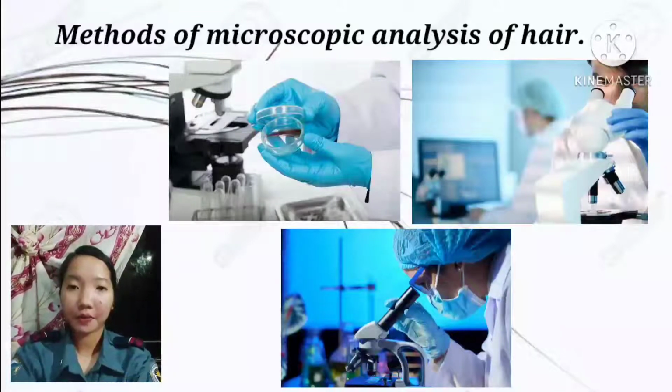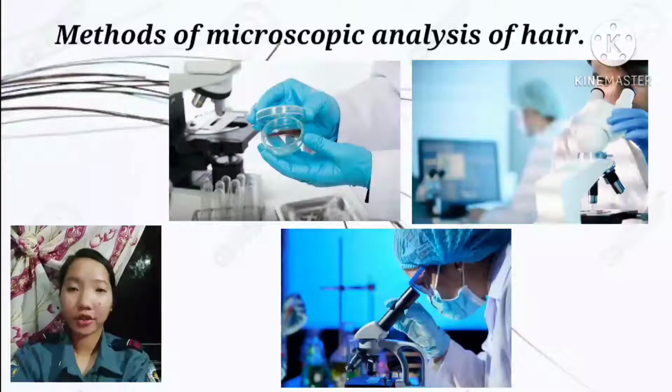The first step of the examination is kailangan munang i-verify or identify whether the hair in question is galing sa human or animals.